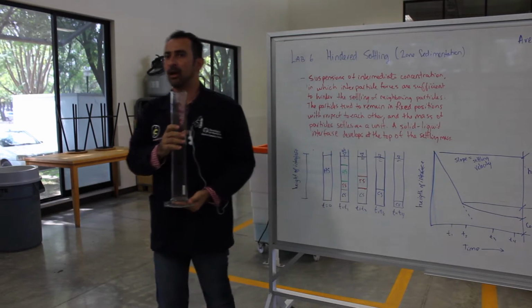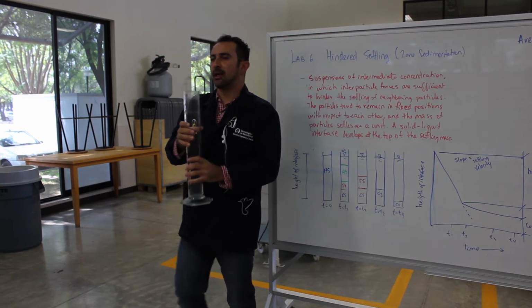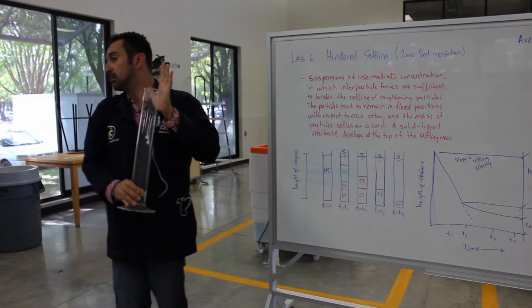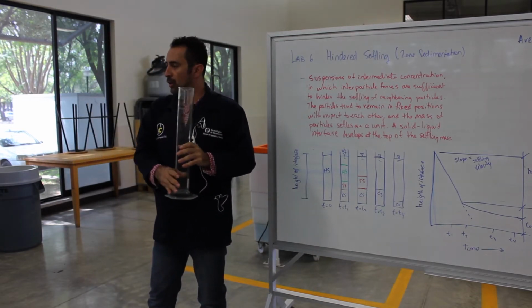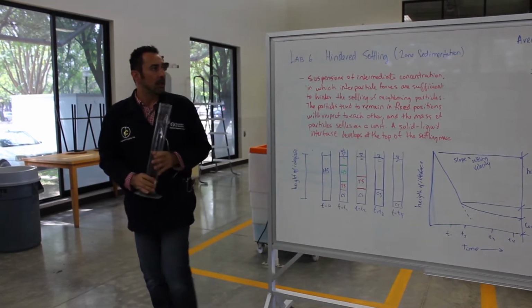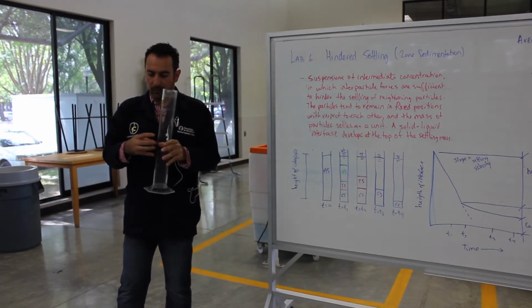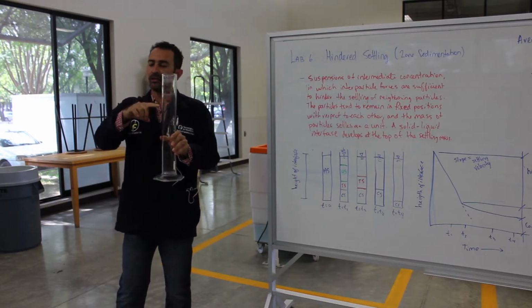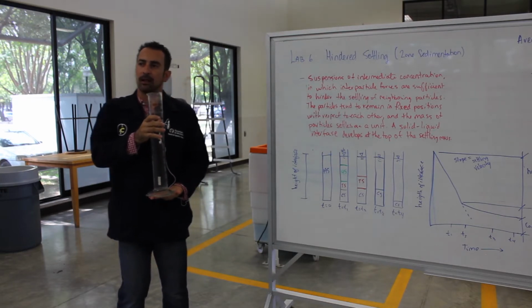You're going to gather at least 10 liters of wastewater from tank 4, and then we're going to dilute our wastewater with distilled water. That will help those particles in suspension of intermediate concentration, which will have a force on them, so they will be pushed together at the bottom, so we could see the different zones in which these sediments will be settled.